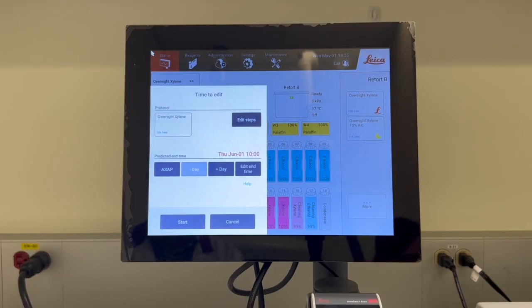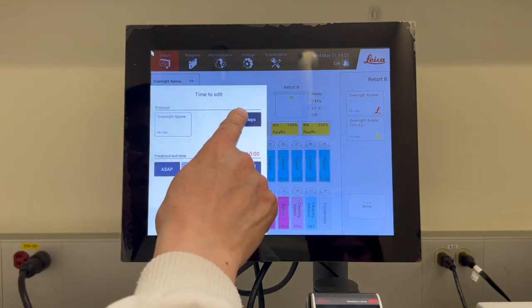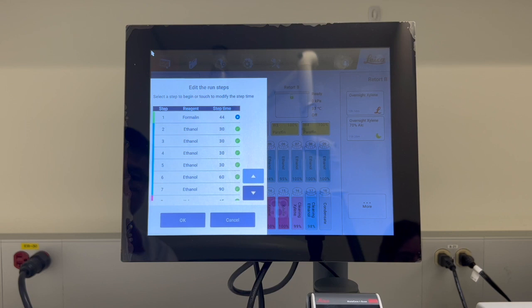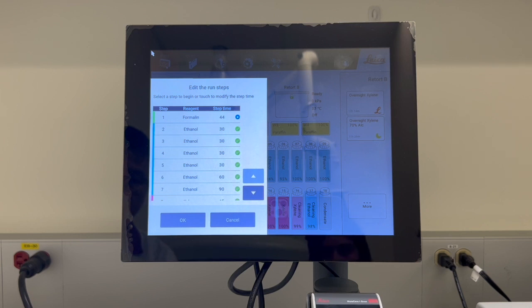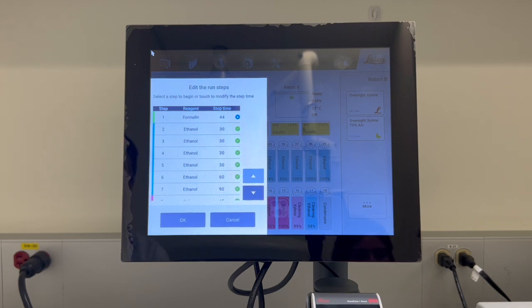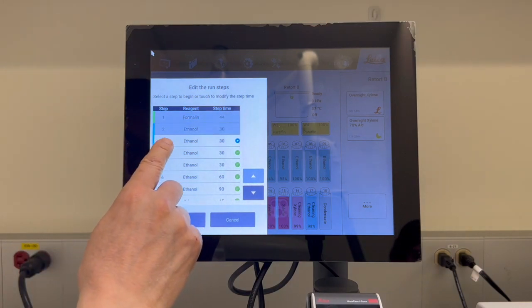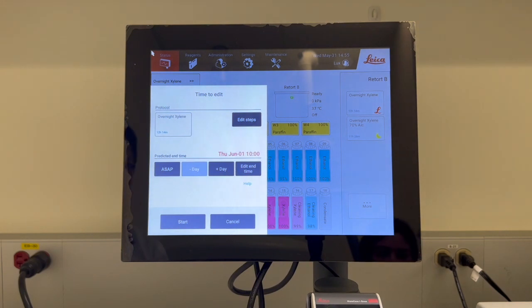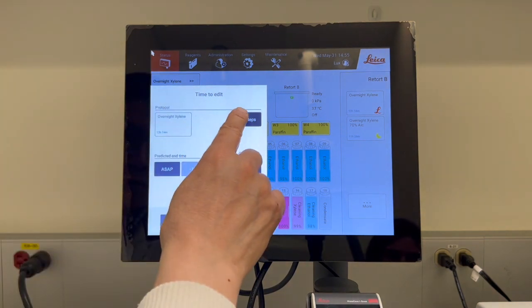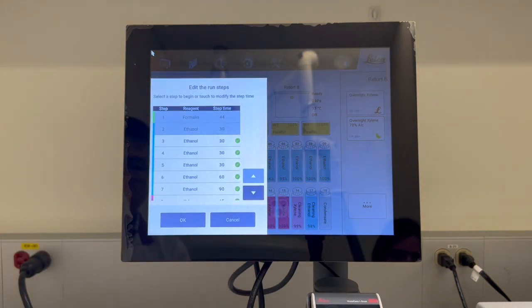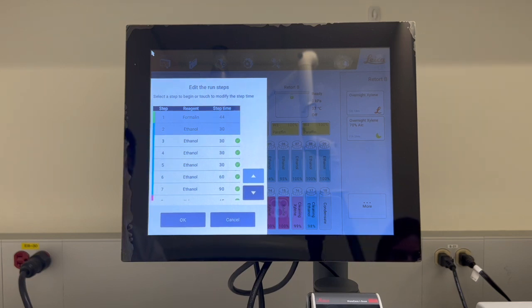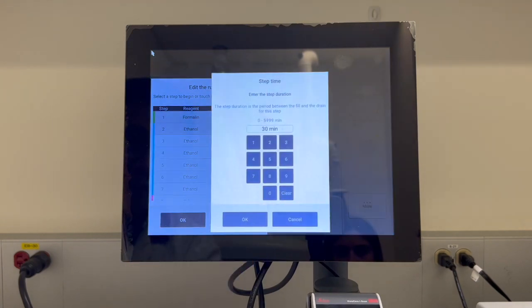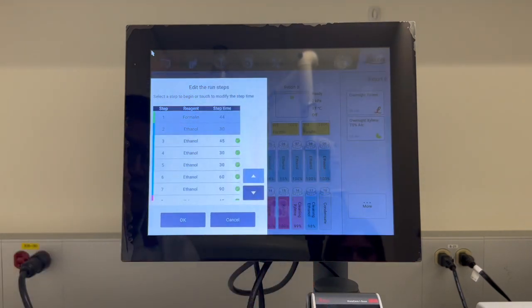Now the scheduling screen will appear. If you want to change the step from which the run starts, tap edit steps to open the edit the run steps dialog box. To skip one or more protocol steps, tap the step icon for the step that you want the protocol to start with. For example, if you want to skip the first two steps, you can tap step 3, then tap OK. If you would like to change the step time, open the edit the run step dialog box, tap the current step time, then set a new time in the dialog box. For example, we can change the step time to 45 minutes on step number 3, then press OK.